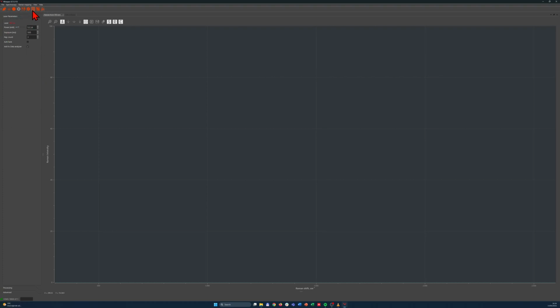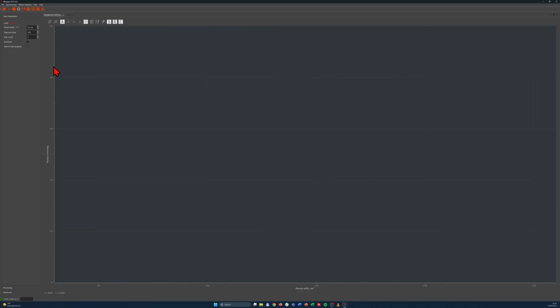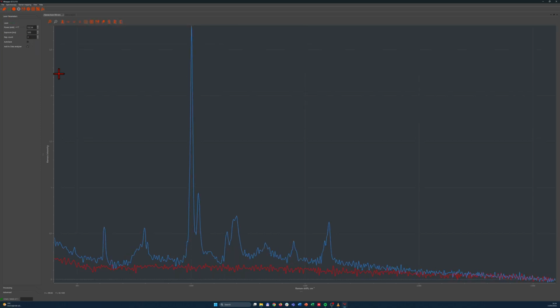Then some Raman mapping settings for the microscope. So we're not covering this because we have miniRaman spectrometer device and data analysis. So data analyzer can also be started from here. So let's start the laser. We start the laser and we immediately see two spectra.